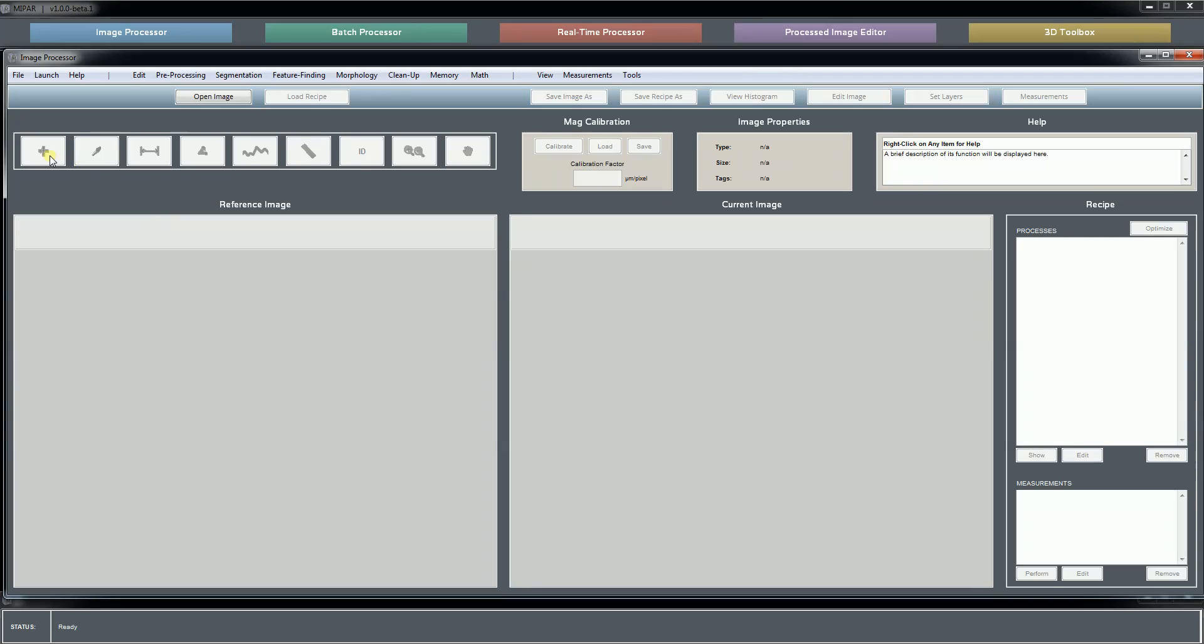Here we have our image toolbar that gives us different interactive tools like measuring distance, measuring angle, taking a line profile, measuring parameters of features, identifying the feature ID number, and zooming and panning.